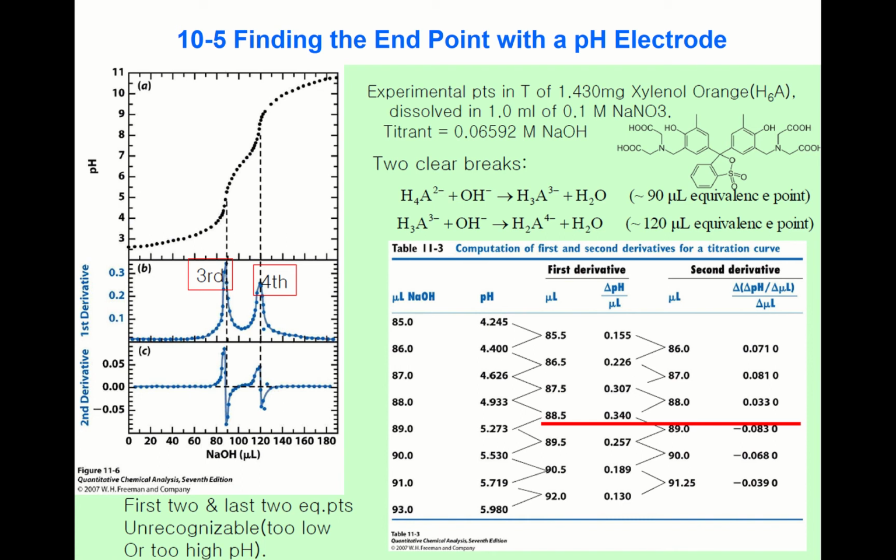But in order to follow the entire titration curve, you need to have a means to measure the pH at each point. And so for this case, the pH electrode is often used. If you take an electrochemistry experimental course next semester, you will use just pH electrodes and pH meters.